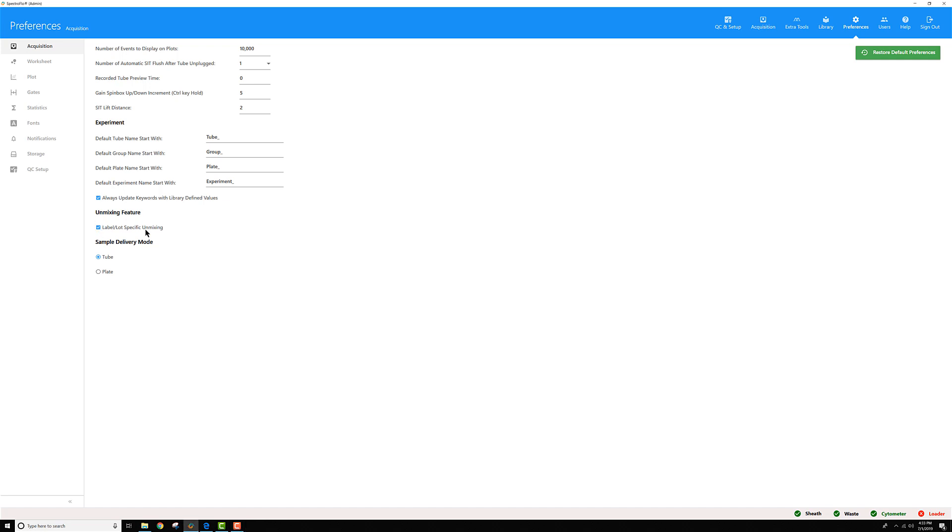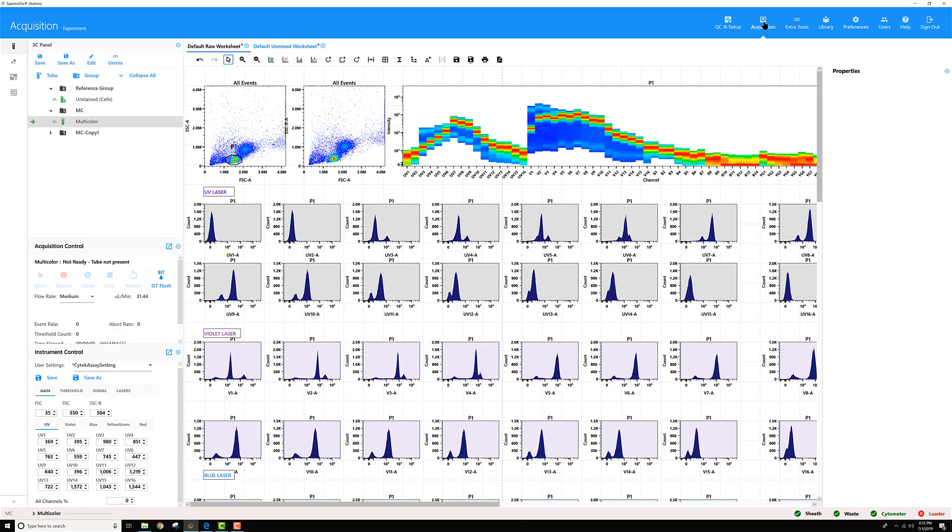Once that's active, you can use lots to further classify reagents that you store as your reference controls. I have this partially recorded experiment called Three Color Panel.